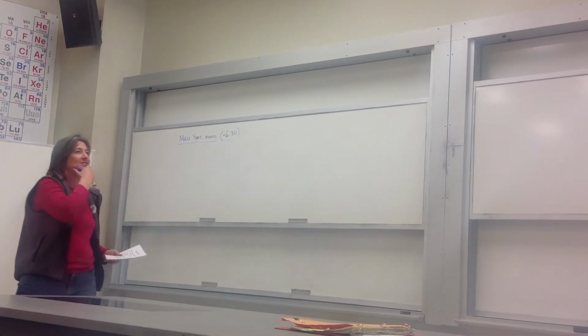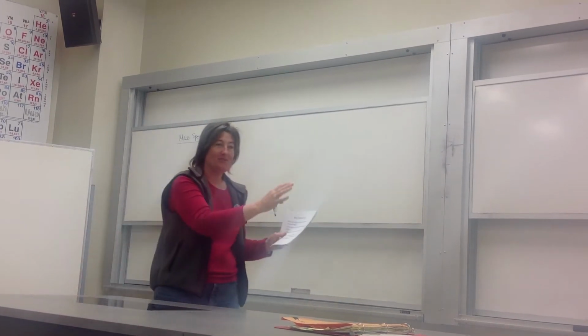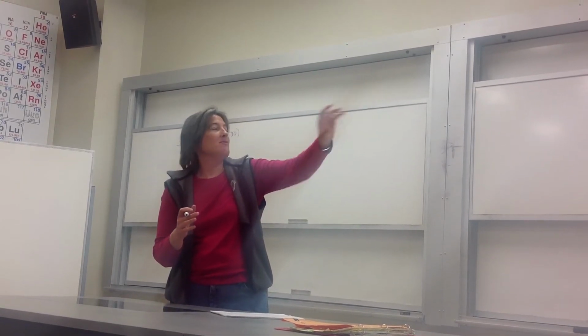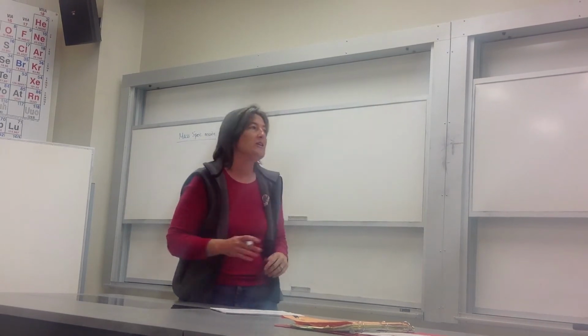Now, as far as mass spec goes, normally what I do is I shine the spectrum on the board and kind of draw all over it. Can't do that in this room. So we'll kind of muddle through. We'll have the spectrum up here, and then we'll be drawing fragments there. Okay, you'll just have to match the fragments to the spectrum as we go through.